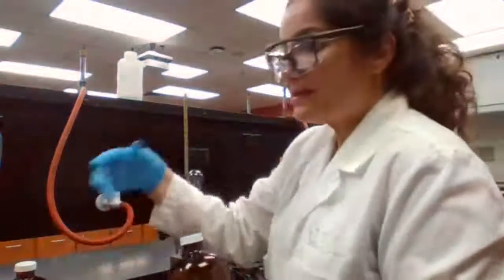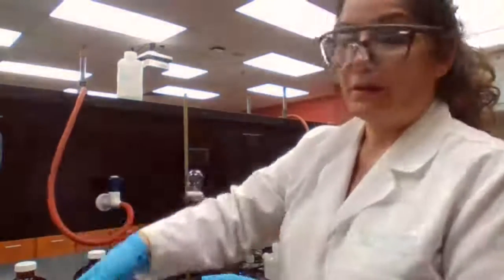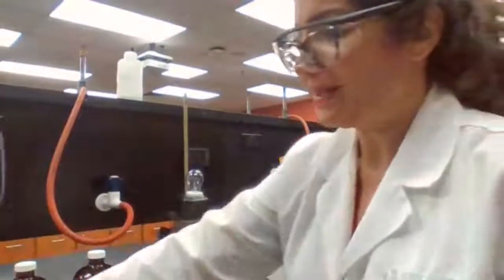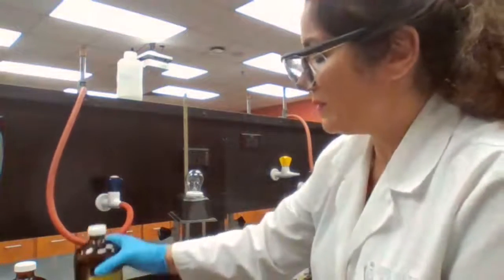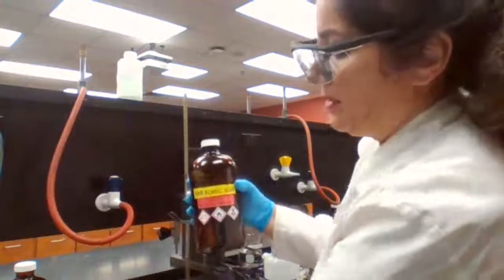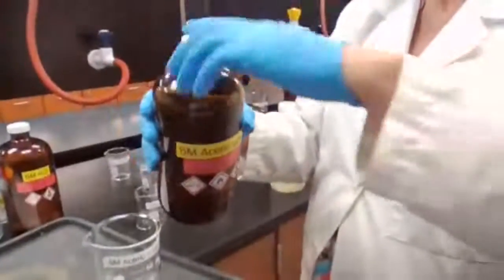So it depends on the nature of the reactant and the nature of the product. We can't say that reactants or products are always electrolytes. Since we got the acetic acid now, I'm going to actually do that part of the experiment for you.